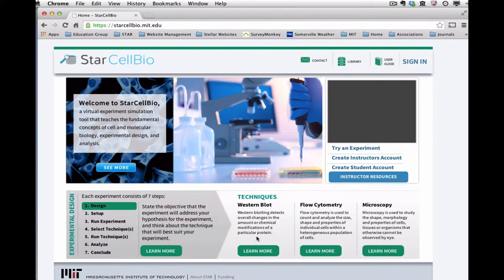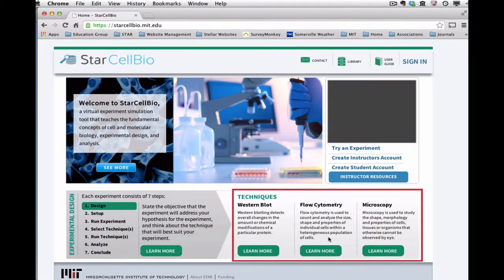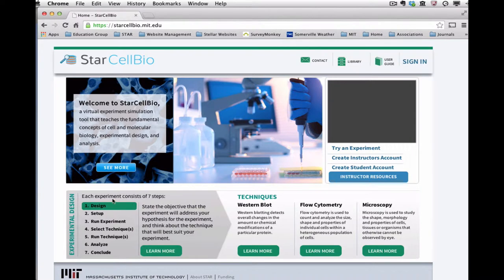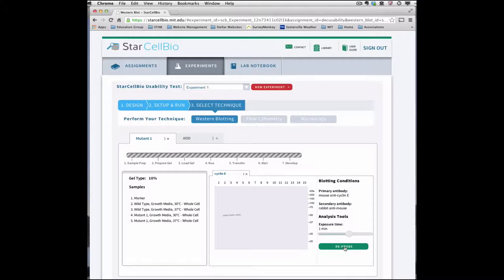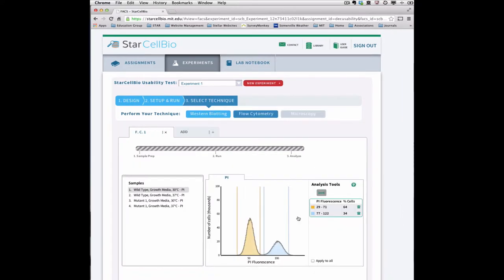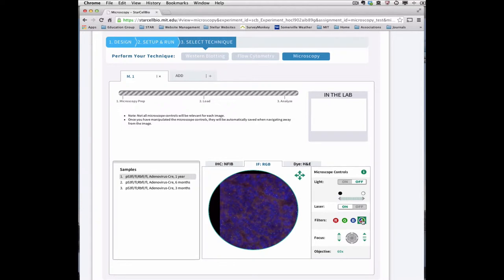The goal of StarCellBio is to enhance student understanding of cell and molecular biology experimental techniques by providing students with the opportunity to design, conduct, and analyze their own simulated experiments using experimental techniques such as western blotting, flow cytometry, and microscopy.